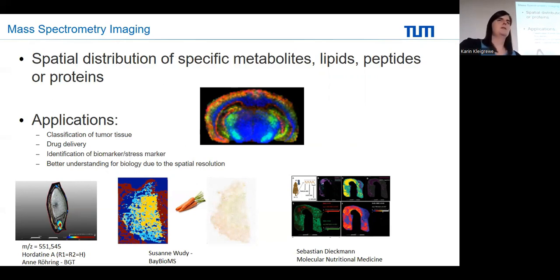If you go into the pathology department or have a biopsy, usually manpower looks at the biopsy and then decides this is tumor tissue or not. If you try to move this technology to a mass spec, which can also say tumor tissue, non-tumor tissue, it can also work day and night, 24/7, and it doesn't have just 8 hours per day to work. So that's why there are huge applications moving into tumor tissue.